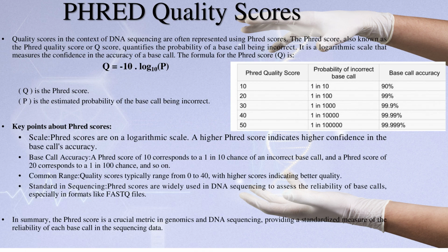Phred scores essentially convey the machine's confidence in accurately identifying each base. A higher Phred score indicates lower probability of an incorrect base call. The table below illustrates that as quality scores increase, the probability of error decreases. Each quality score corresponds to a character, and this character signifies the quality value for a specific nucleotide.